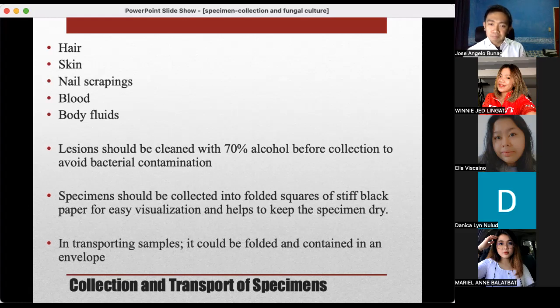Okay, another, you could use Petri dish for handling, particularly for culture. Some labs do this for a better aeration and a large surface for colony isolation. And with the use of your Petri dishes, better handling and storing. However, it dehydrates yung ating mga culture. And hazardous ang Petri dishes kasi madali siyang ma-open.